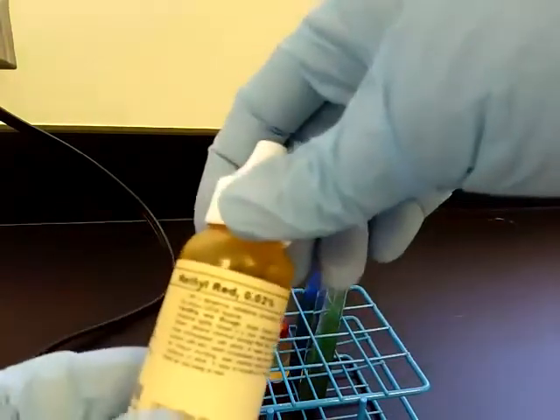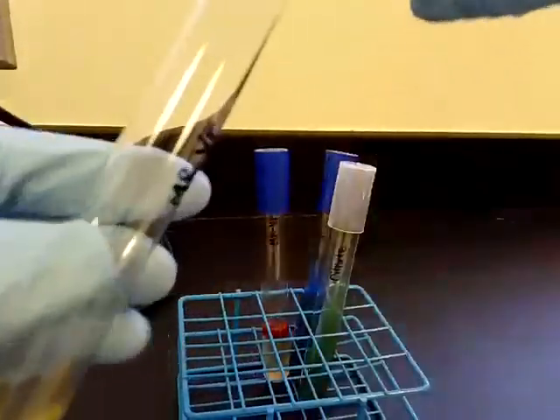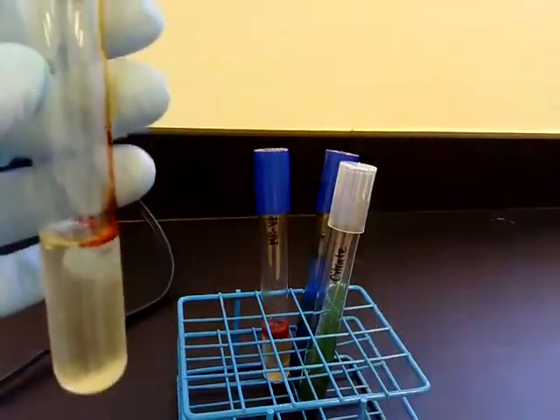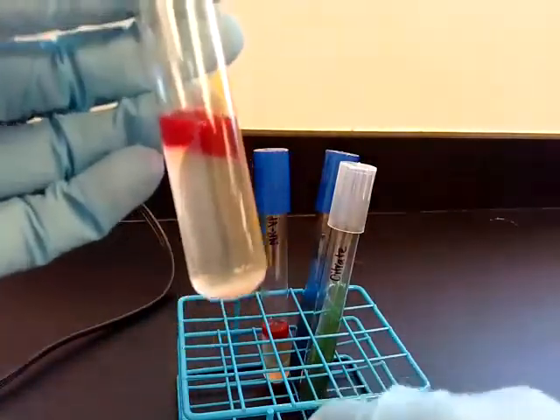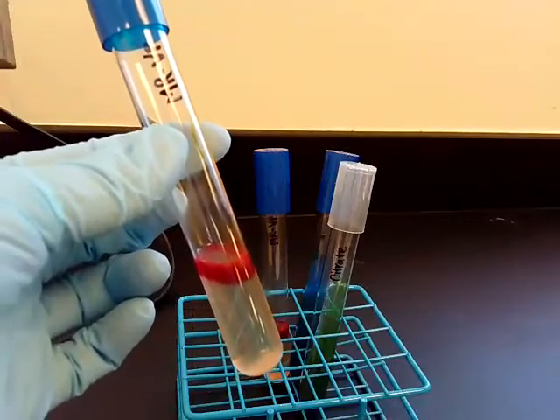So we have our dropper bottle of methyl red. And set that down. And I'm just going to add a couple drops. And a red color change is a positive result. So as you can see, this is positive for mixed acid fermentation.